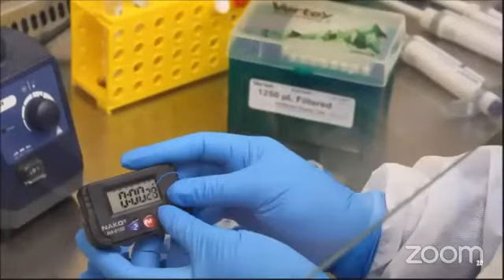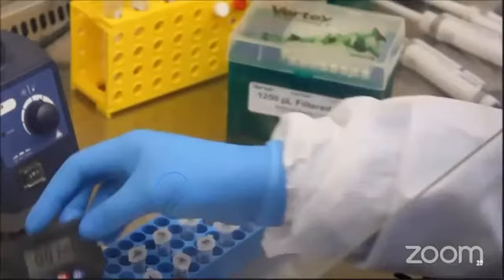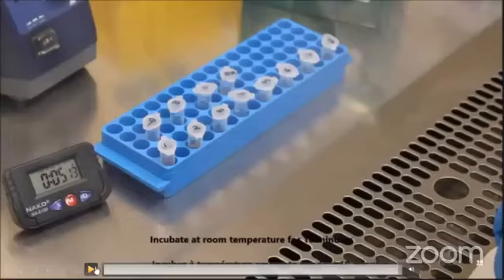After this, incubate the samples at room temperature. This incubation destroys the RNases and also denatures the proteins.